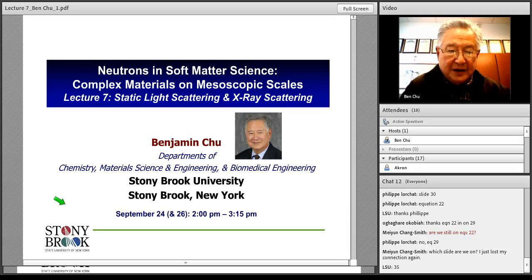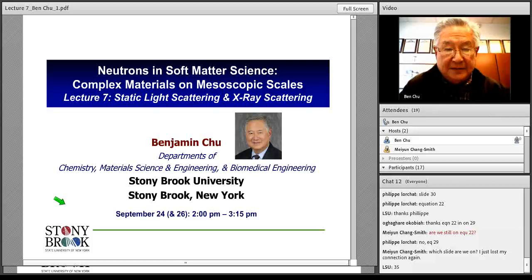The sequence is the same, but the distances have been changed, and this is the part you should be careful about. Looking down from the instrument, you will see a pinhole, a lens, a pinhole. But they serve different purposes, and the results are quite different from each other.